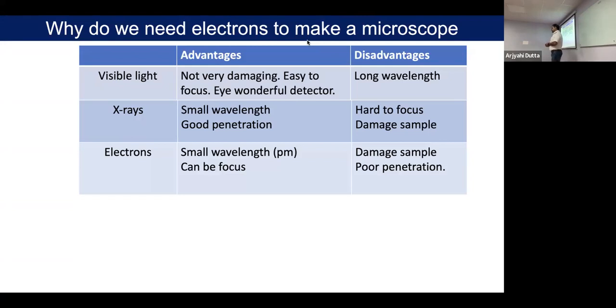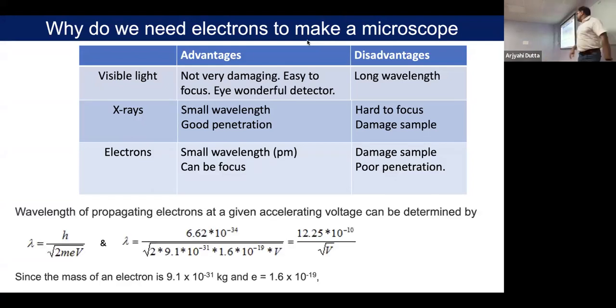Okay, so I'm saying this is a picometre range wavelength. How do we believe it is a picometre range? We have to calculate something, right? The best way to calculate this is with this formula. How do we get this formula? If you remember de Broglie's equation, we have lambda equal to h, the Planck constant, divided by mass times velocity.